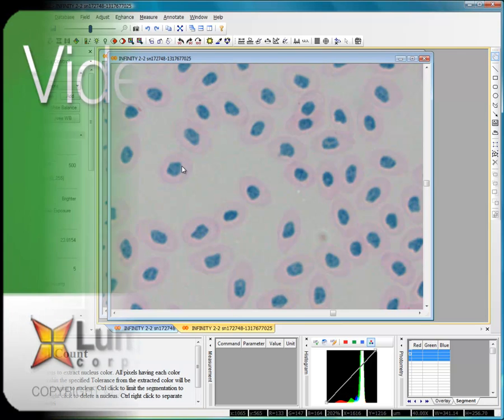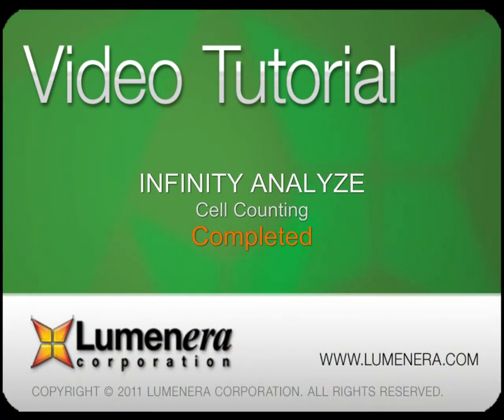That concludes the video tutorial on cell counting. Be sure to investigate other video tutorials in the Infinity Analyze series.